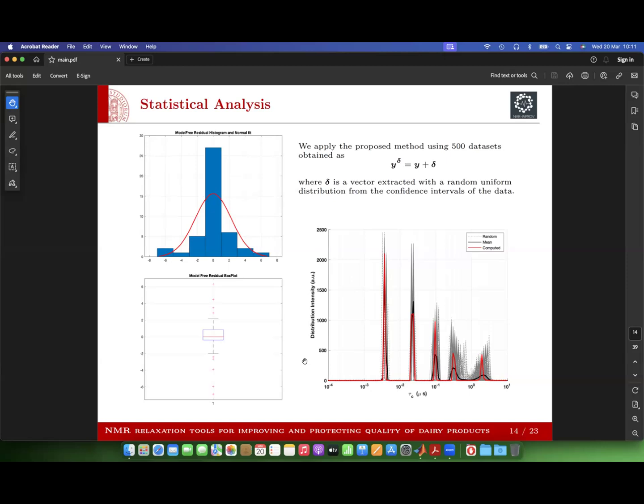Yes, I think that you can think of this as the value of the correlation time with a confidence interval around this peak, obtained by this repetition, considering all, let's say, the large number of peaks that you obtain around the same peak.